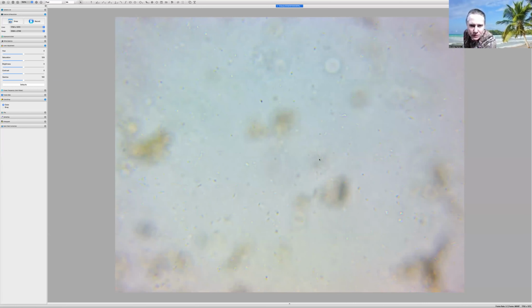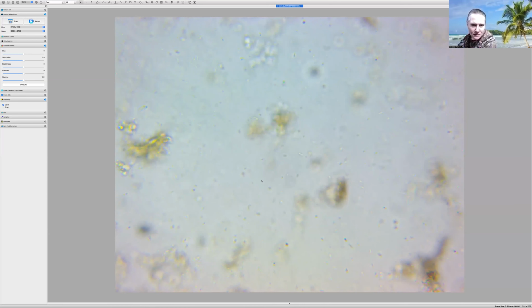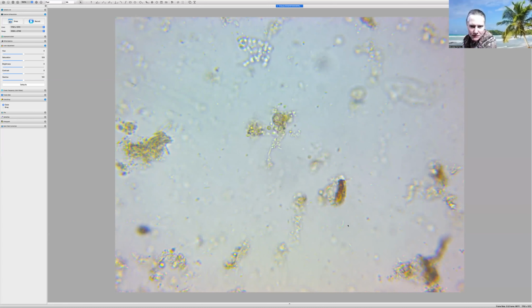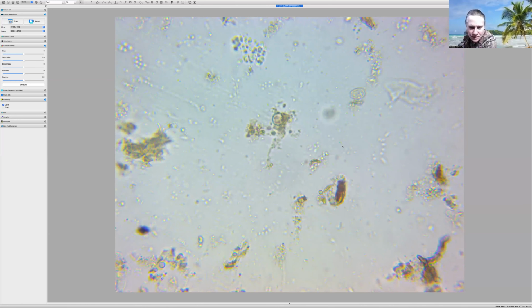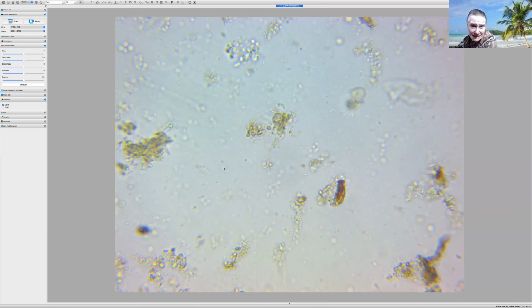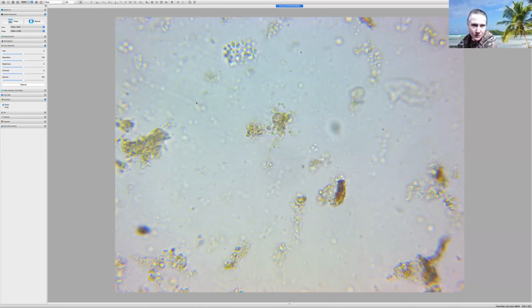Okay, so here would be a filamentous type bacteria. I can show, like, this looks like a streptobacilla. Getting down on those teeny tiny levels, you just have to find all the different species. Even different sizes of the same shape are also different species.